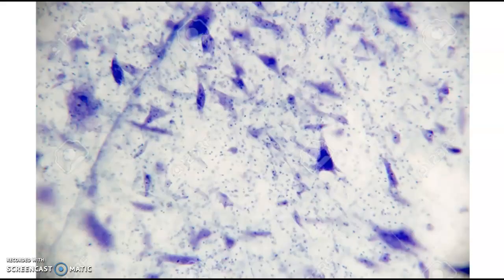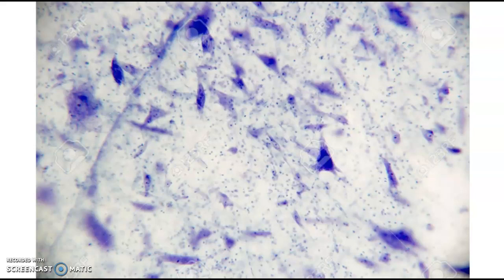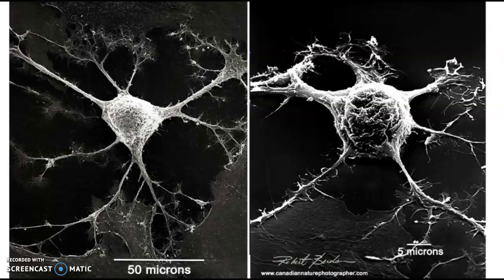Another example are these things. Can you tell what those are? Because I showed you on a previous slide a cartoon version of these. These are nerve cells. So this is what they look like underneath a light microscope, but look what they look like underneath an electron microscope. And look at all that detail. Right? So by using electron microscopes, we can get a lot more detail because of high resolution. We're going to use light microscopes and look at things like this week, right? We're going to look at these types of patterns.